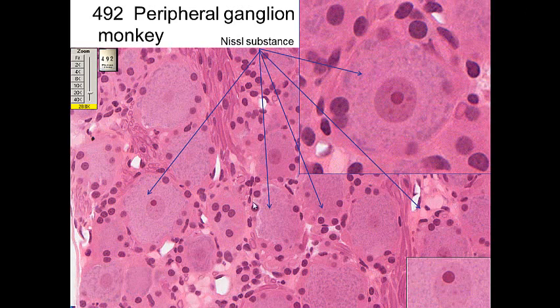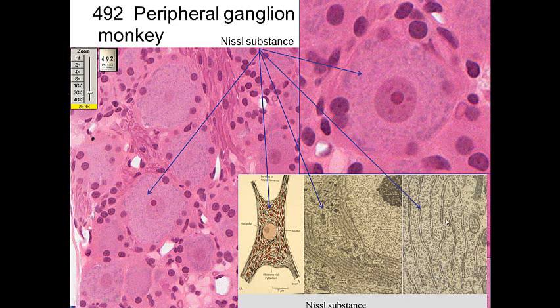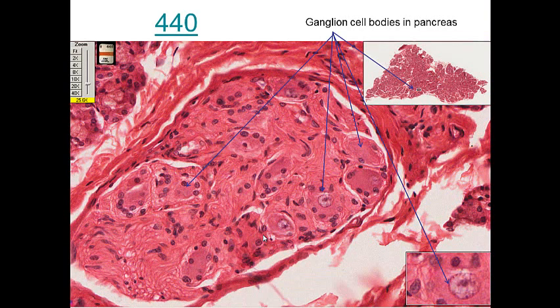In these various profiles you can see the satellite cells around the ganglion cells — nucleus and nucleolus of the ganglion cells. What we're seeing, the roughness, is the ribosomes — polyribosomes on rough ER or just free ribosomes. That's the Nissl substance we see that's making proteins. In this tissue, which happened to be the pancreas, we can see ganglion cells. There's one cell here, another cell right there, and you can see the nucleus and nucleolus in the cell body, the ganglion cell, and satellite cells around it as well.